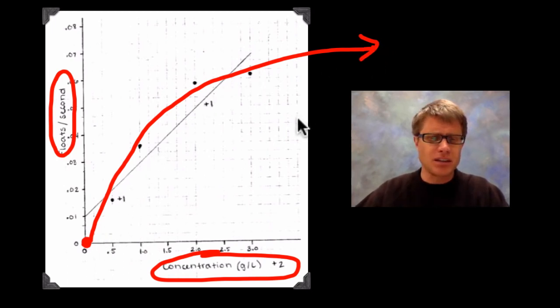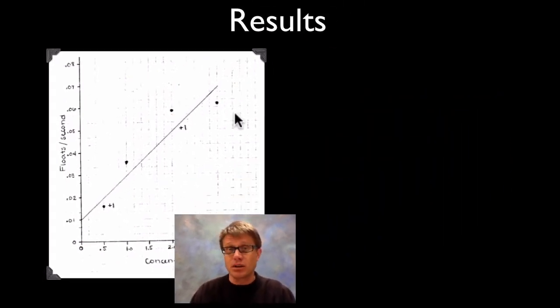Now you might think to yourself, well, we're increasing the amount of yeast. Why doesn't it keep going linear like that? Well, the reason why is that even though we've increased the number of enzymes, we broke down so much of that hydrogen peroxide that it doesn't matter anymore. So this would be the curve results that we would expect.